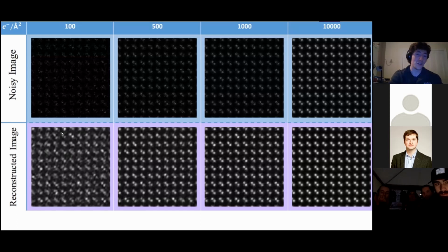For the 100, you have a slight issue in the in-painting aspect of it. There's a single pixel there in the vacuum between two, I guess, silicon atoms, and it's trying to represent that as its own atom because it's forcing a linear combination of eigenvectors on it. At that point, it becomes a little bit unsuitable, but you can layer on further approaches like variation regularization to fix that up quite well.